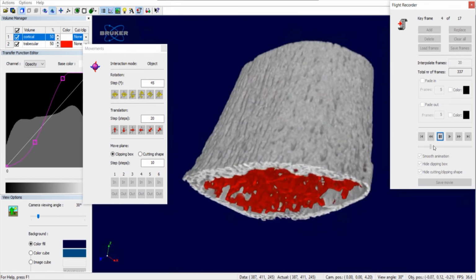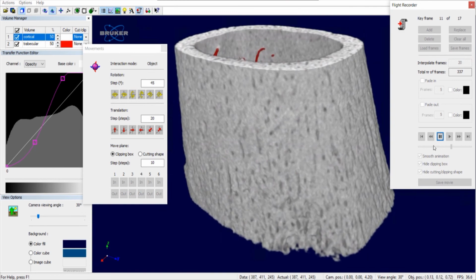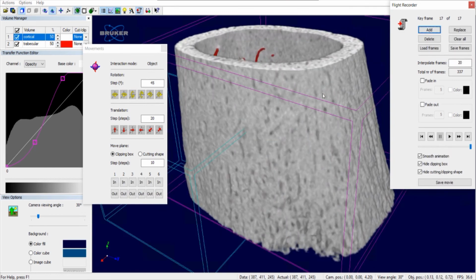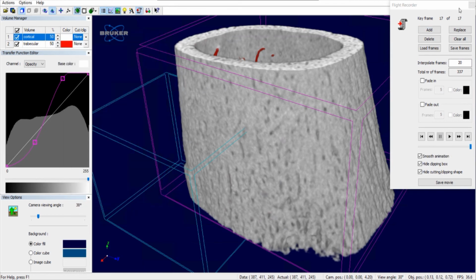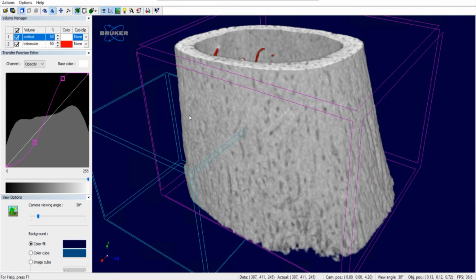See how it's much smoother than when I make it with my hands. Always the same speed. So this is quite good. Try it out. So I'm not going to save another video here.